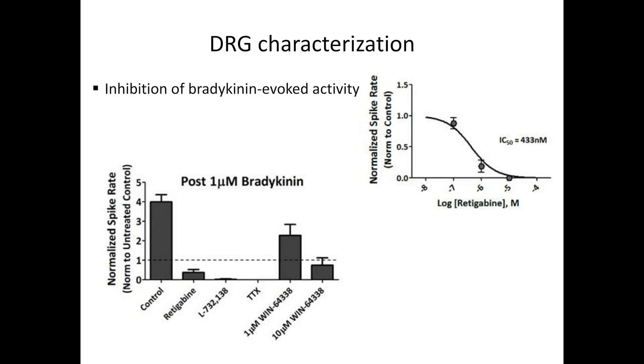So we wanted to also probe using bradykinin as an insult to these cultures to really increase activity. And so that's what this is showing here on this slide. We'll just focus here on this bottom graph. You can see under control conditions, we see again a nice robust increase with bradykinin, 1 micromolar bradykinin.